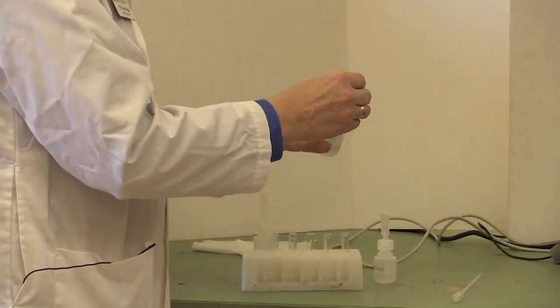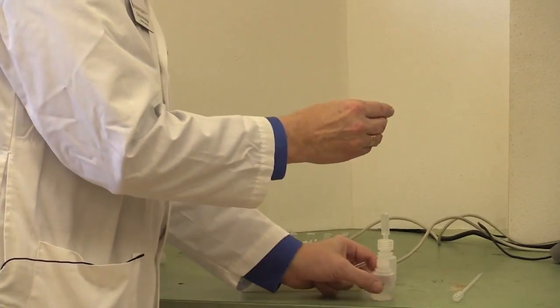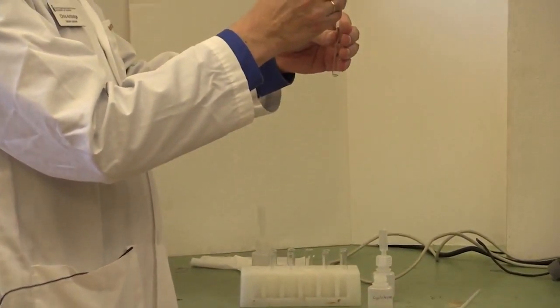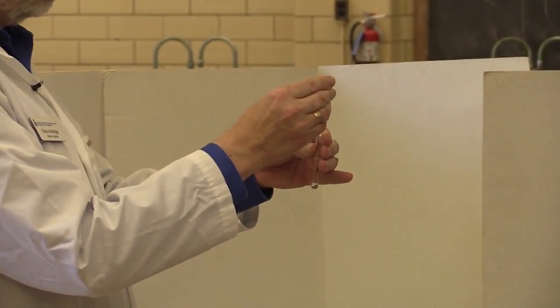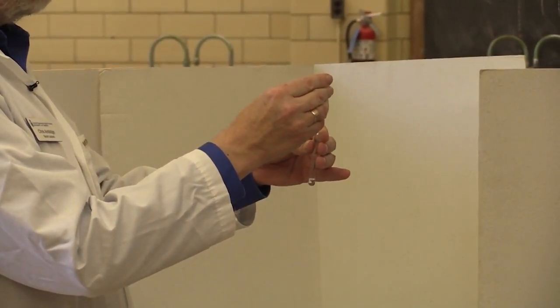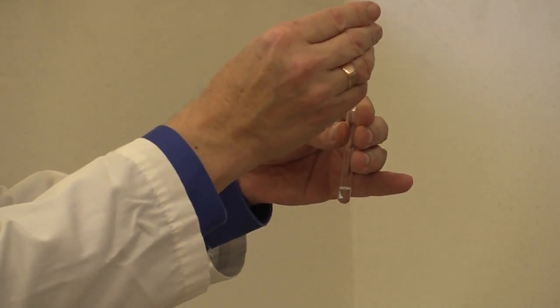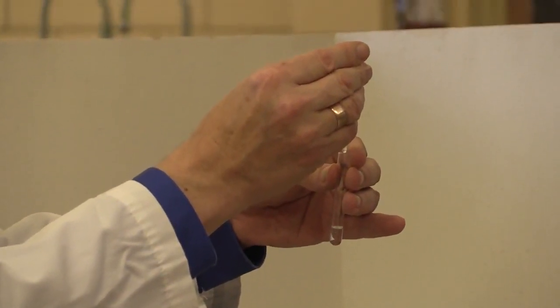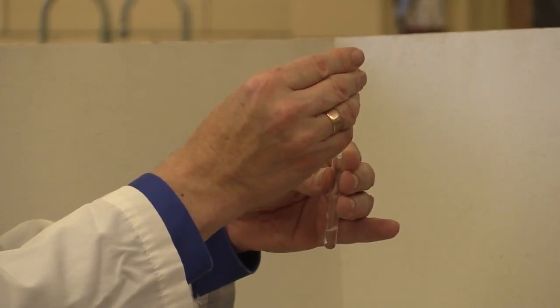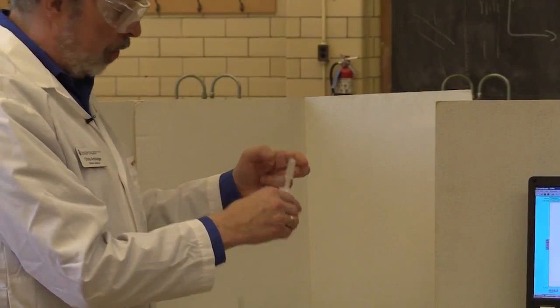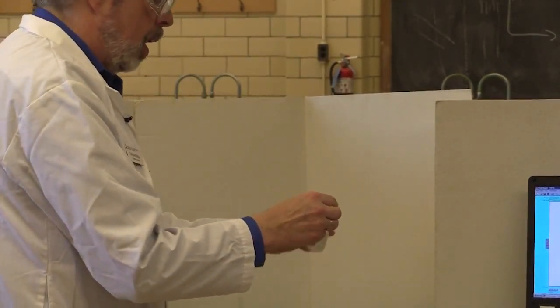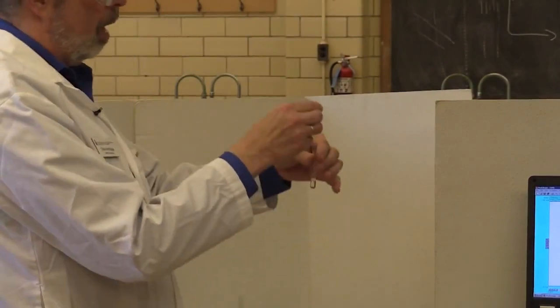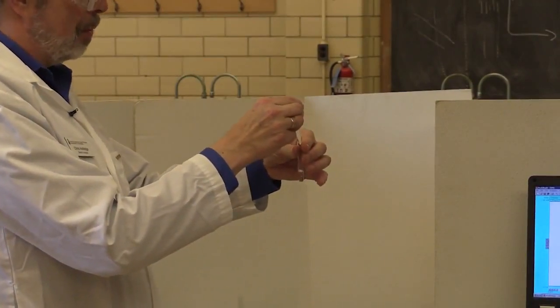So, take one of these tubes and I'm taking cyclohexane here. You'll need to take 30 drops, it doesn't have to be measured super accurately, of cyclohexane in this. [Counts to 30 drops]. As I said, you don't have to be super accurate because you're going to be analyzing the system on the GC later. Then you take methanol and likewise add about 30 drops.